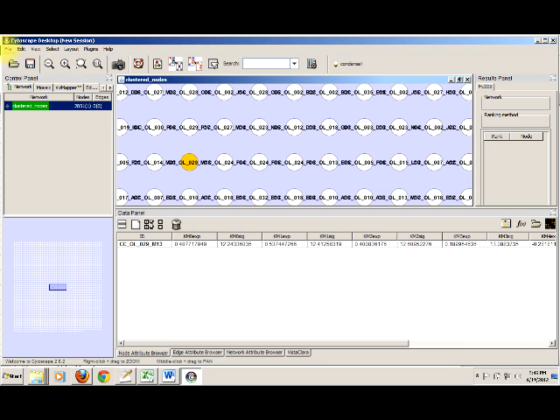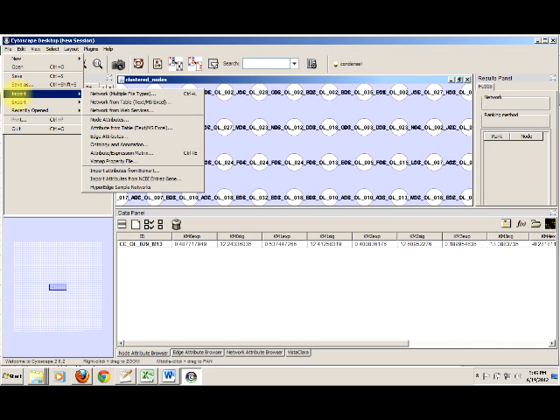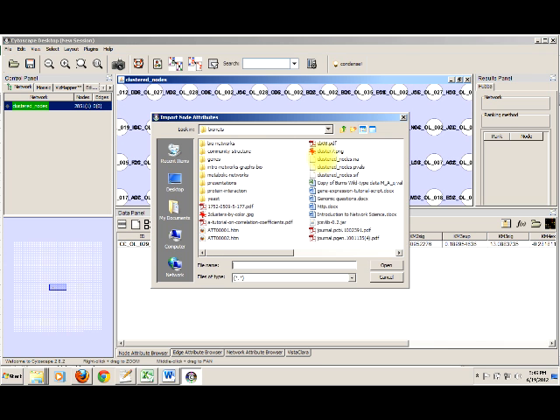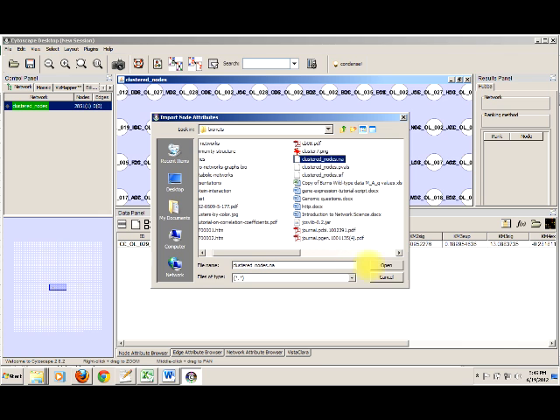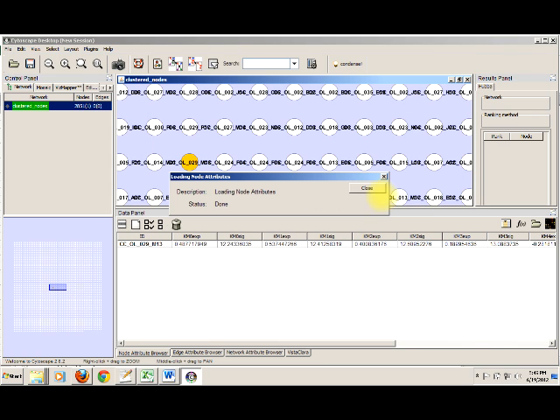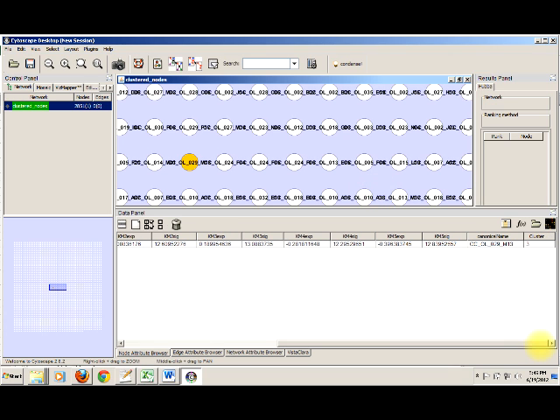The last step is to associate our cluster data. Go to Import > Node Attributes, select clusterednodes.na, and click Open. When you close it, at the end of the file you'll see it has added cluster data. As you click on different nodes, that cluster value will change because we've mapped each node to its appropriate cluster. All of our data importing is basically done.